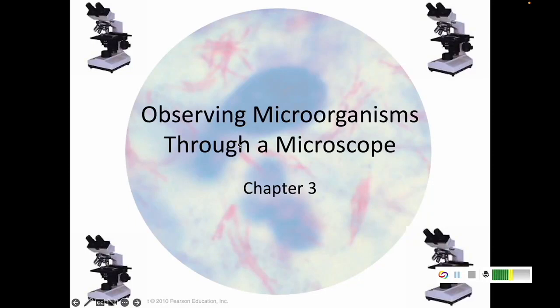Hey microbiologists! I'm so excited for our class today because we are talking about microscopes. We'll get to spend a lot of time in lab playing with them and actually doing stuff with them, but we're going to talk a little bit about how they actually work, a little bit of understanding some of the theory and functions of a microscope.